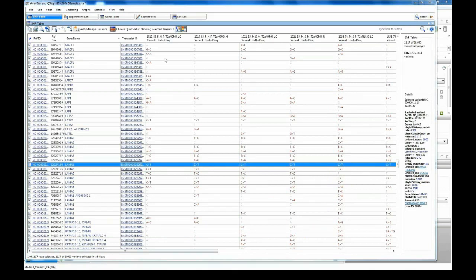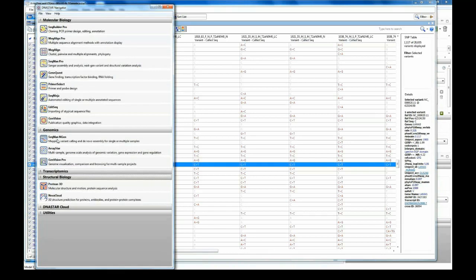So what you're looking at here is an exome study, a targeted gene panel study of paired lung cancer versus normal tissue from Illumina data types. Now we've run this through our NGS assembler, which is this right here, SeqMan NGen, and then we've opened the project in ArrayStar, which is for multi-sample filtration.